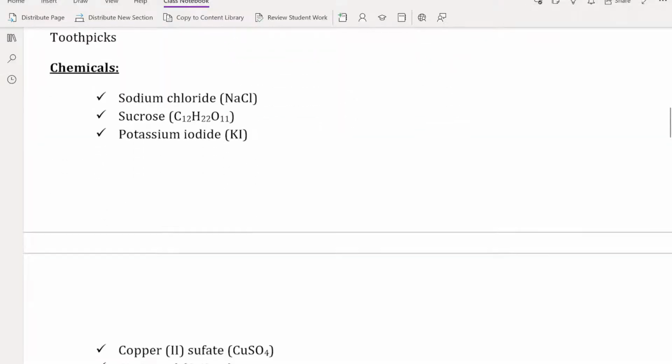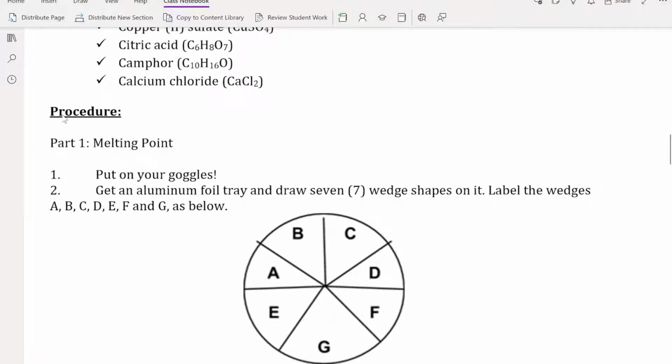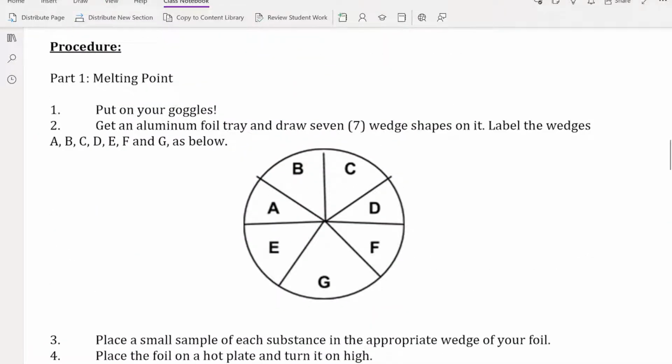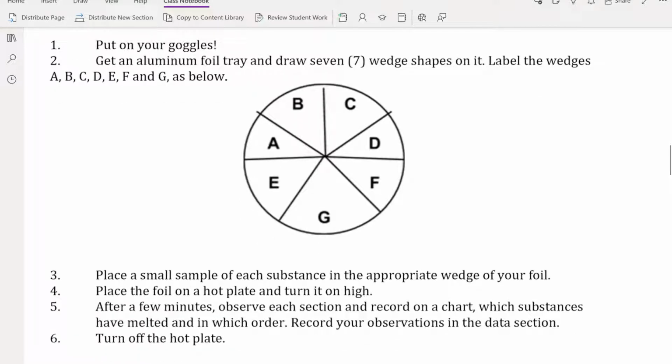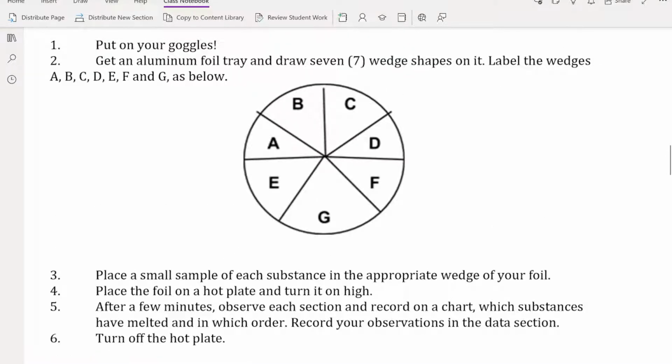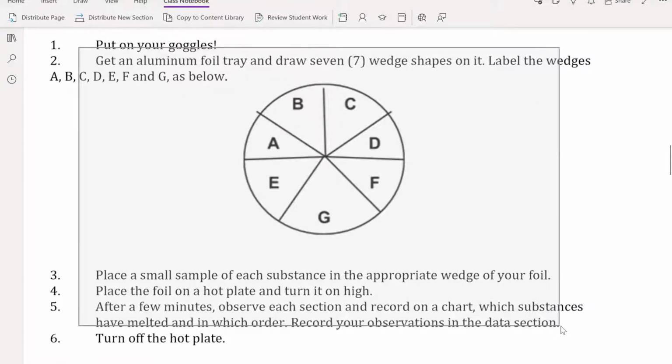Then I would go back in here and look and say, okay, what am I doing? Procedure, part 1, part 2, part 3. And if we look at this, the procedure we're doing tomorrow is actually pretty simple. In part 1, we're going to go into the fume hood. We're going to put our goggles on. We're going to get an aluminum foil tray. We're going to make wedges in it. We're going to label the wedges. We're going to put a little bit of each of the samples we're studying on this. Then we're going to put it on a hot plate turned on high, and we're going to see what order they melt in. So we know which of our compounds has a high melting point and a low melting point. Then we're going to turn the hot plate off. That's what we're doing with this little section.